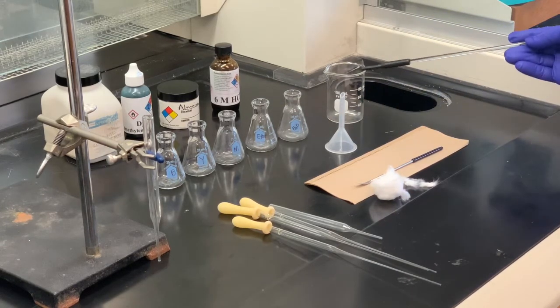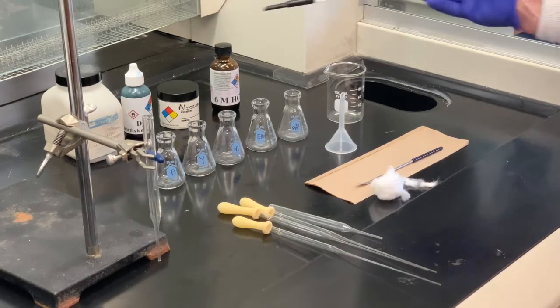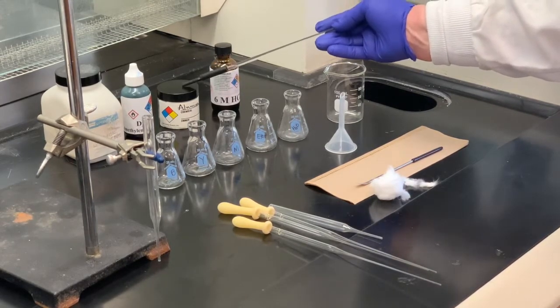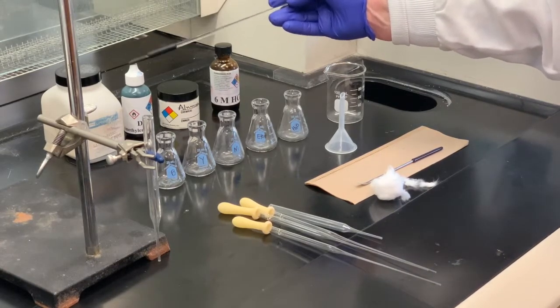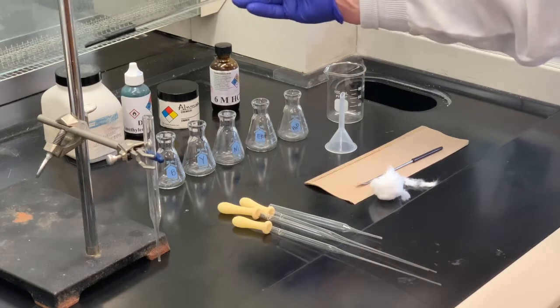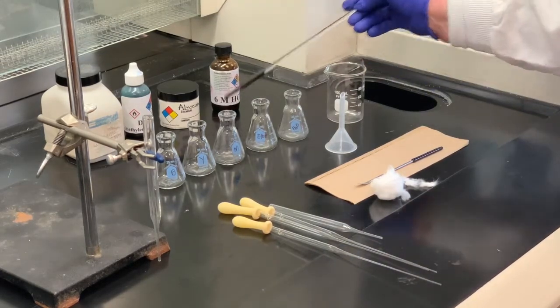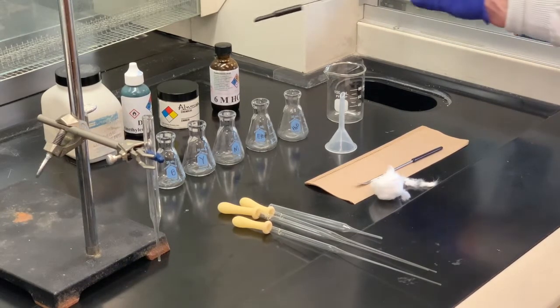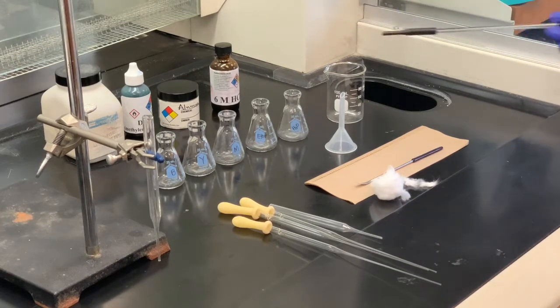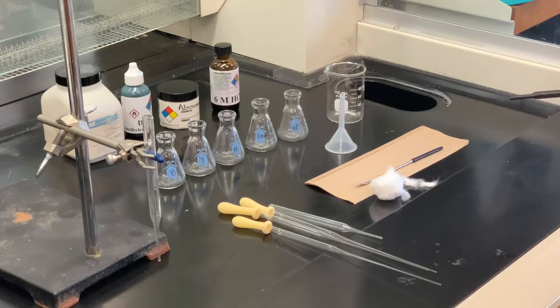We need a small funnel so we can transfer material without spilling it into our column. I need a beaker to make a slurry of our stationary phase, which is going to be the alumina. So the alumina is going to be our stationary phase. This is our dye mixture. It has both the yellow and the blue combined. And then this is sand that we'll need. And if we run into a little bit of trouble with the flow of the material inside the column, we may have to add a drop of hydrochloric acid to increase the flow rate.